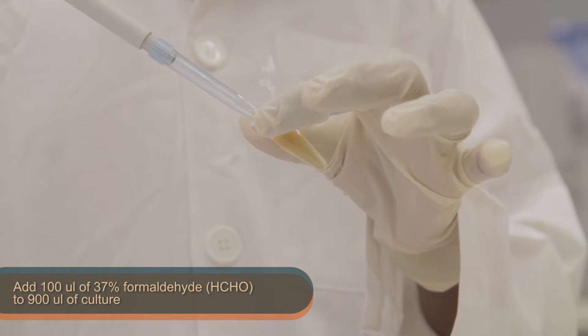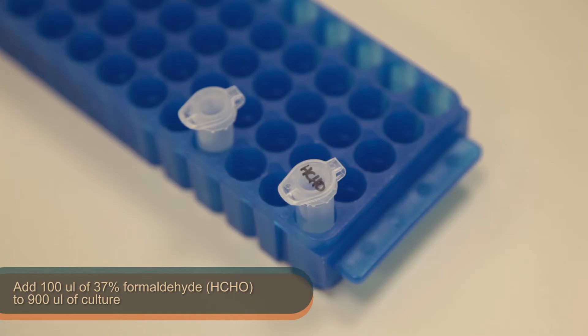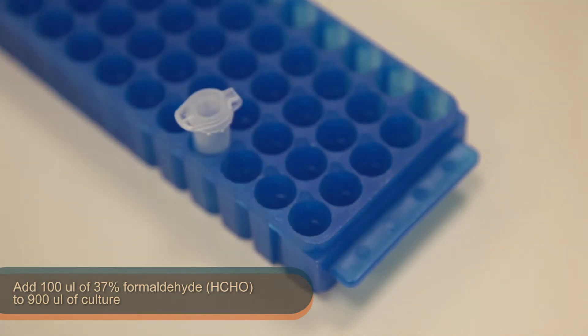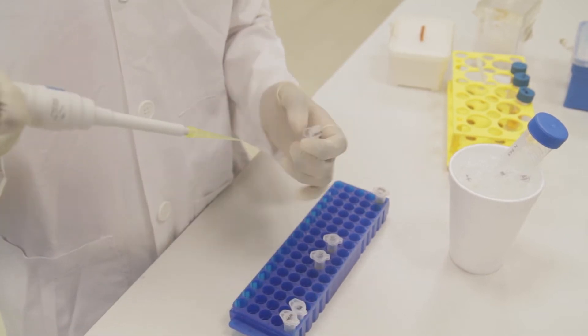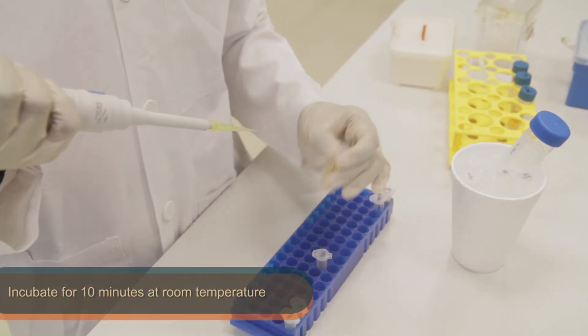Firstly, add 100 µl of 37% formaldehyde to 900 µl of culture and incubate at room temperature for 10 minutes.